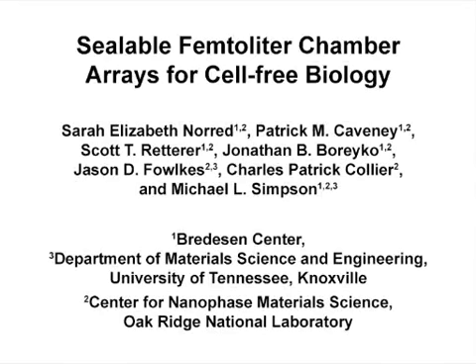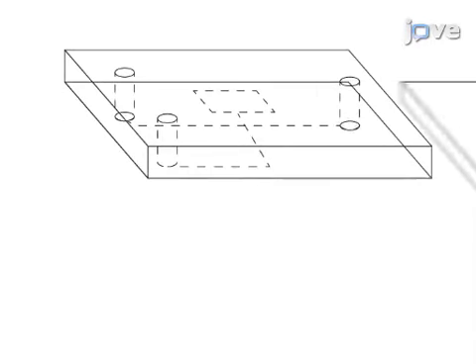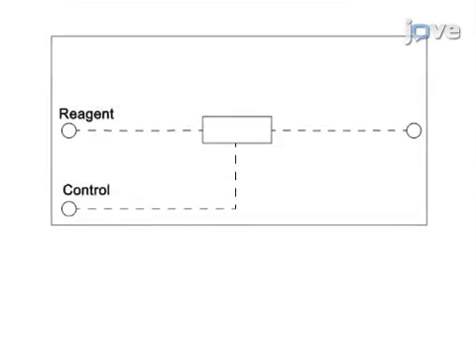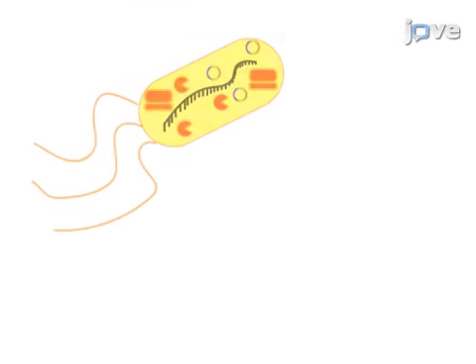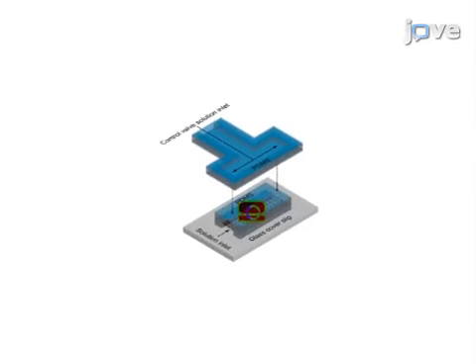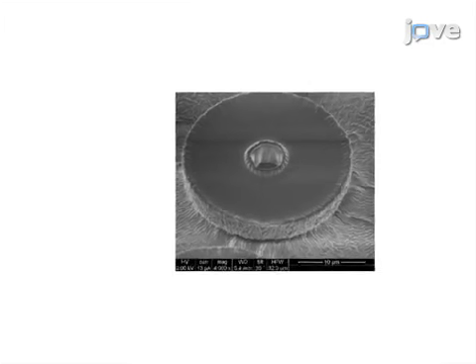The overall goal of this procedure is to confine cell-free protein synthesis reactions in cellular relevant volumes. This is accomplished by first fabricating a PDMS device using layered soft lithography techniques. Then, a cell-free protein expression reaction is mixed, introduced into the device, and an ensemble of isolated reactions are formed within an array of microfabricated chambers.